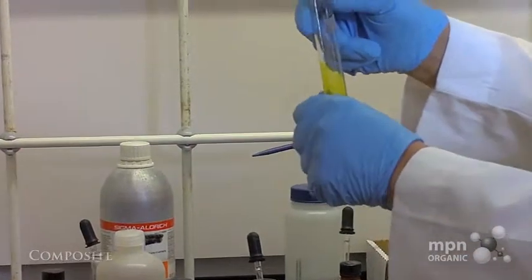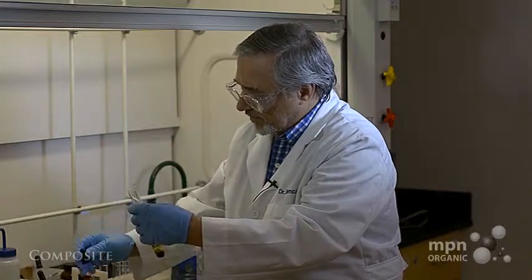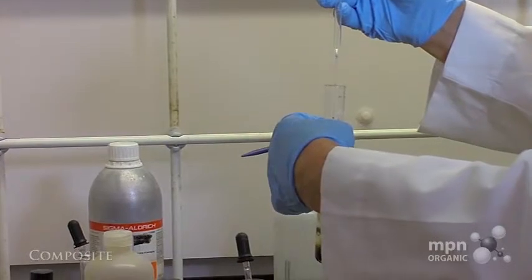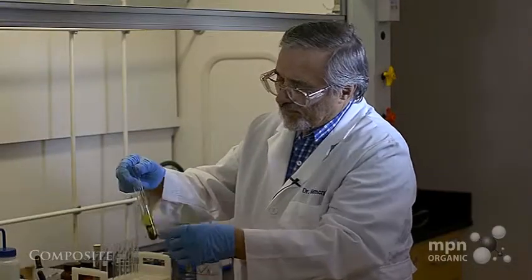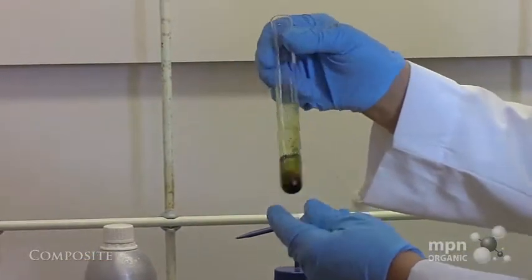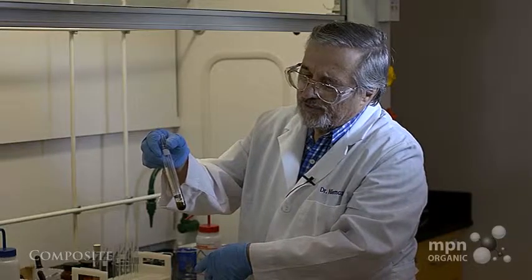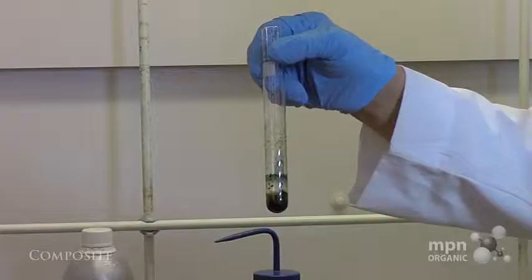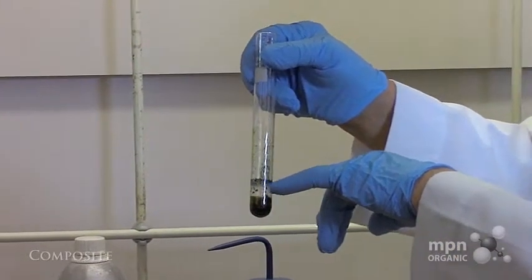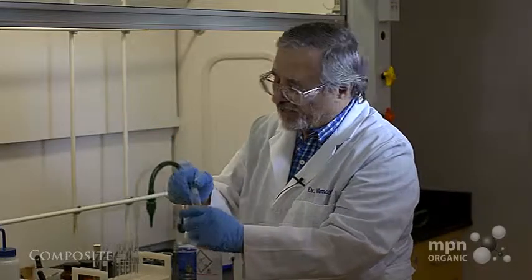Okay. Still plenty hot. It's very hot, in fact. Okay, let's add a little bit more 4-methyl-2-pentanol. Okay, now it's starting to change to all green. Okay, so there we go. There's our reaction mixture. Now, what we formed, remember, is a Cr+3 ion, and this is probably chromium sulfate here, which is water soluble, but is not going to be diethyl ether soluble.